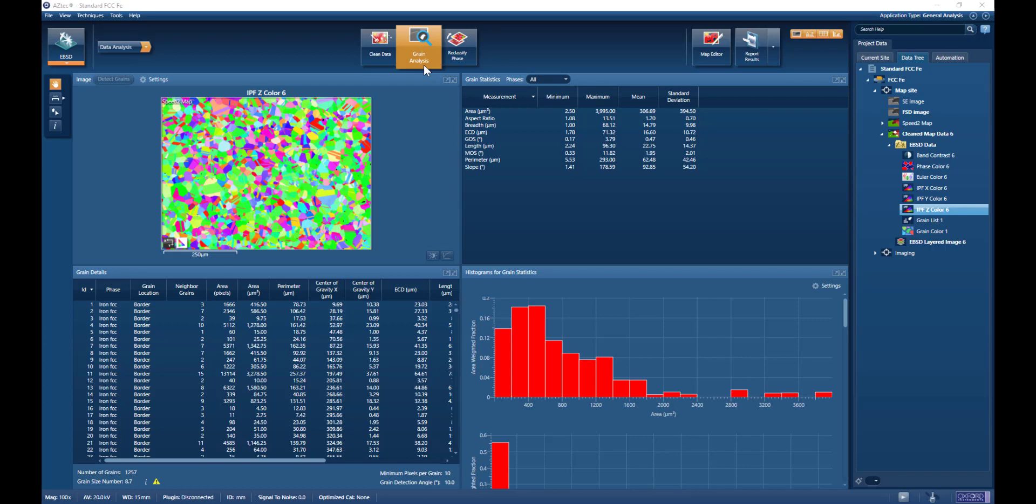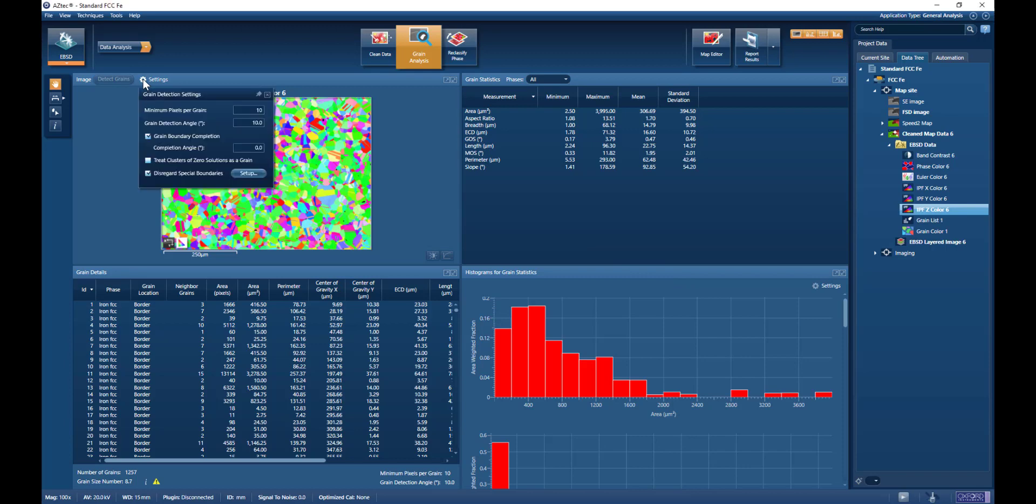So we're here already looking at clean data, and straight away the software is showing me a grain list, the grain statistics, and histograms for the individual parameters. What's important is to look at the settings that we can define for our grain size detection.